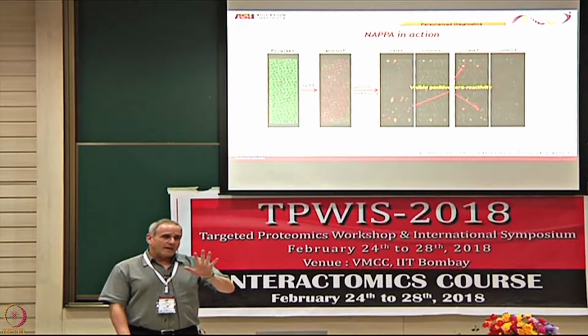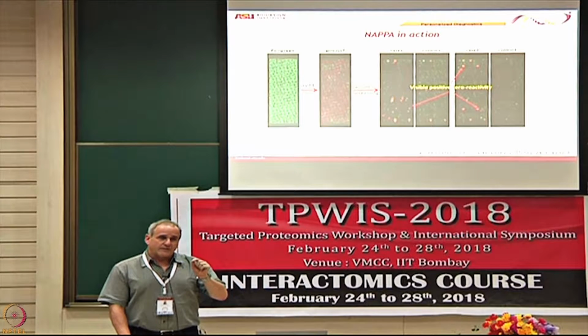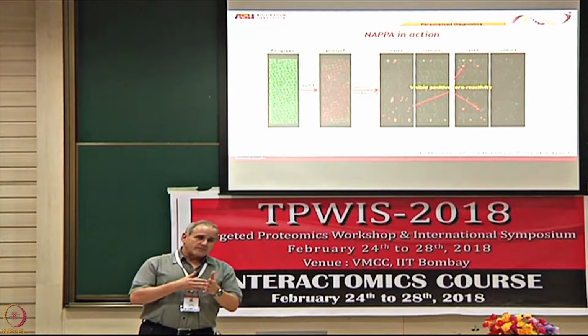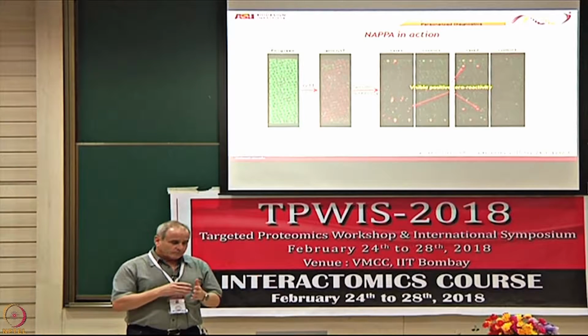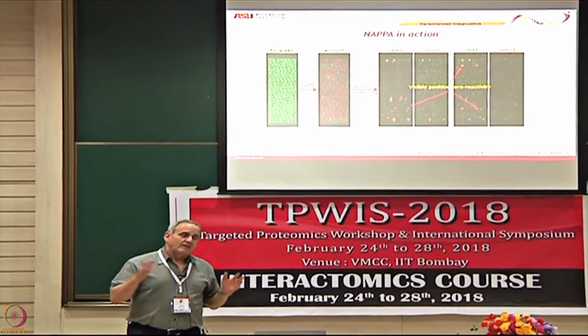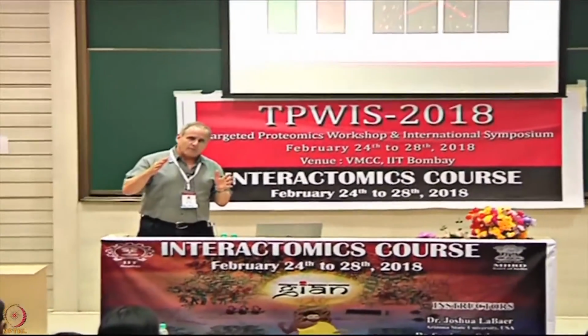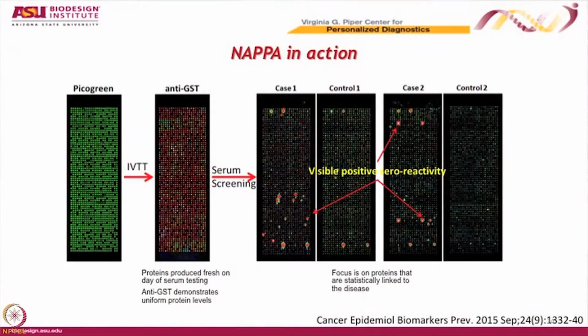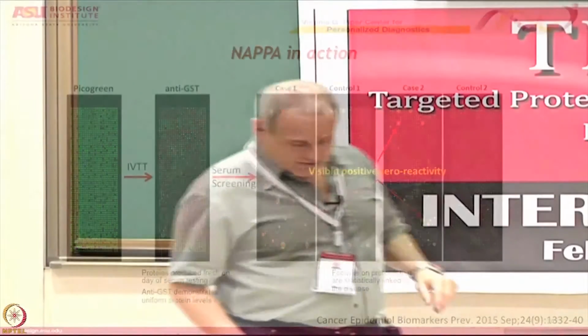What we do is we get a readout of signal intensity, a numerical readout of signal intensity, and then the software adjusts the image, and the color that it represents tells you what level of intensity that equals. If we were to do just grayscale intensity, then we would have pretty much only a 10-fold range. By doing different colors, we can cover a larger range. And so typically blue is weak, green is stronger, yellow is stronger than that, orange is stronger than that, and red is the strongest.